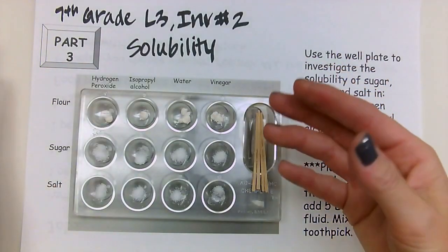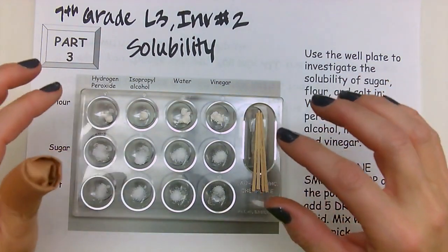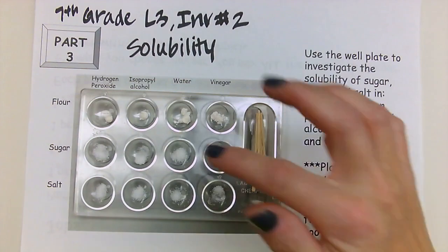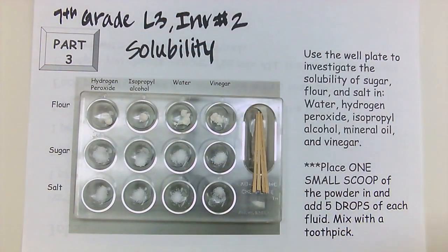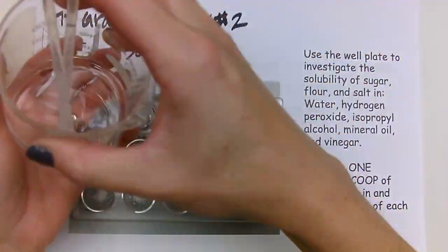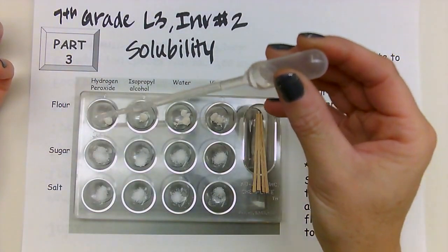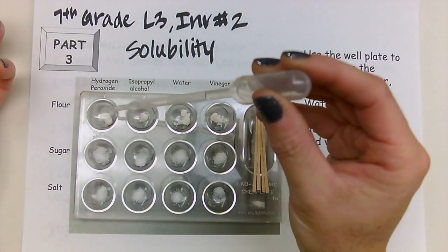So what you're going to do next is put 5 drops of each liquid substance in there. So grab the hydrogen peroxide first. This can be another person's job. Grab the hydrogen peroxide. So I have hydrogen peroxide here. Okay. And you're going to use your pipette, and you're going to do 5 drops in each of the 3 wells. So I'm going to do that now.